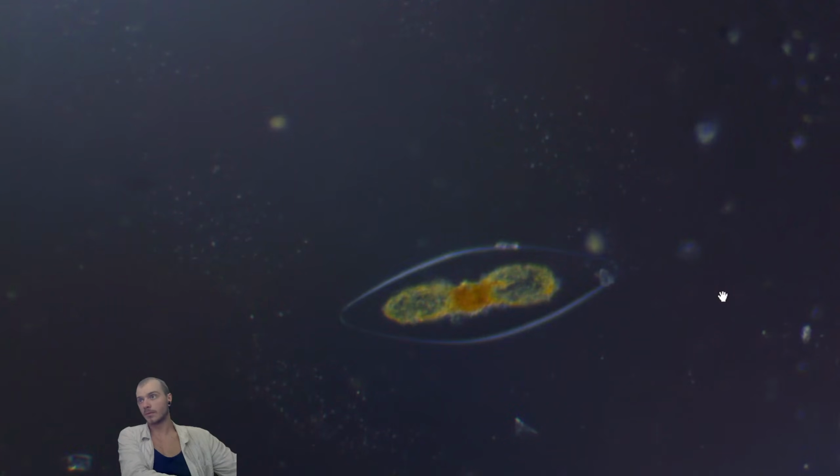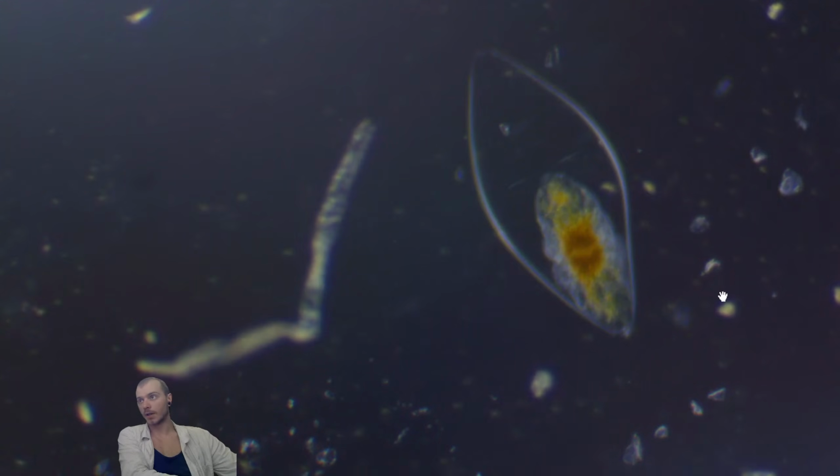I hope we can find a healthy one. Again, this is not healthy. Again, not healthy. I will probably need to take another sample here. Yep.